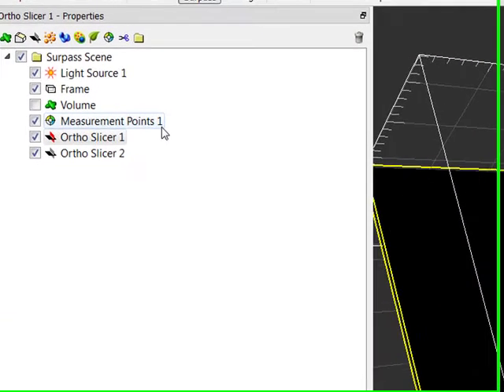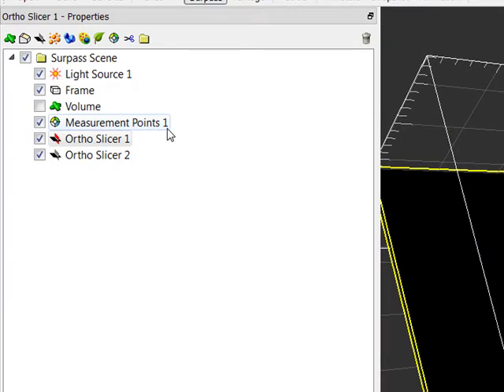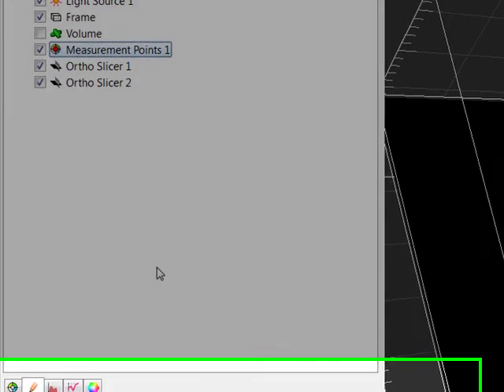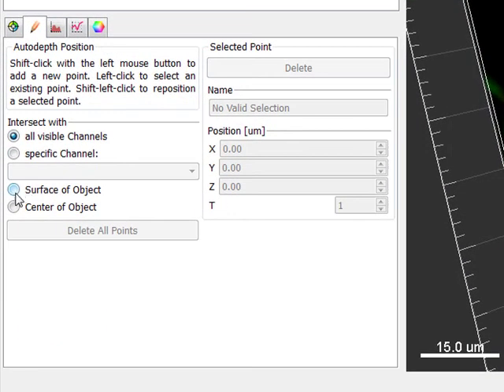Then, switch to measurement points and select the surface of object option.